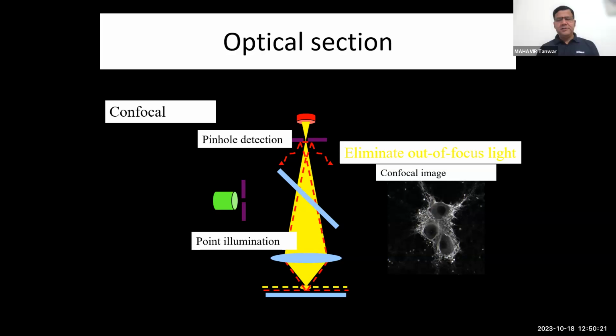Absolutely. See what is happening in a point source: it's a very precise point laser. That's the reason why the laser is used in this. In wide field, of course, it's illuminating the whole volume of the sample. That is the big difference, the illumination. But there will be an improvement if the pinhole is placed in a wide field microscope, though not as much as in the confocal, because the laser is also a big difference. The penetration capability and the point illumination are very precise in the case of laser. Shall I go forward?